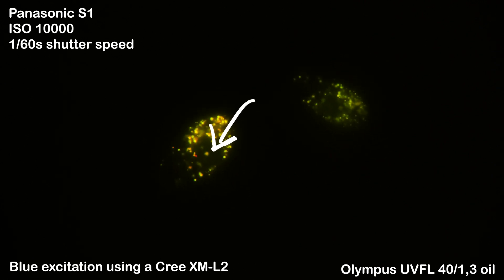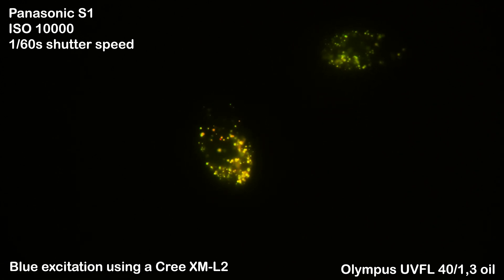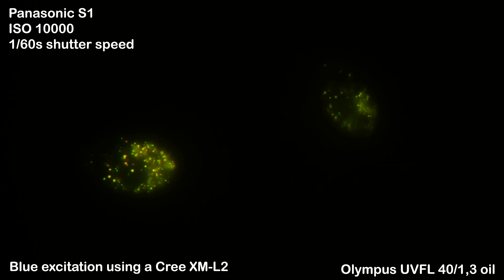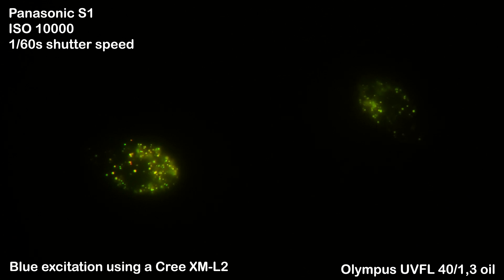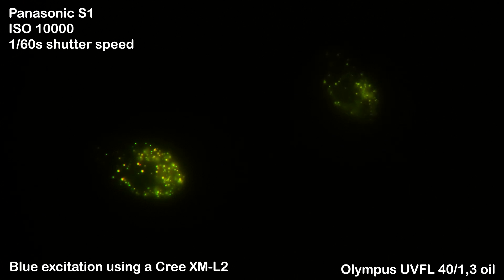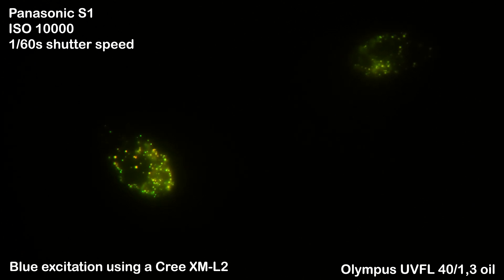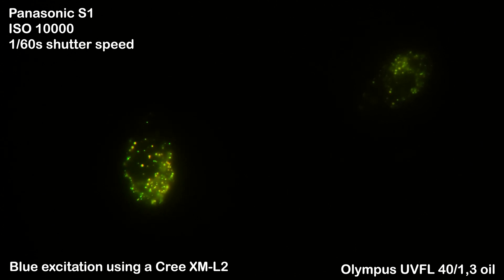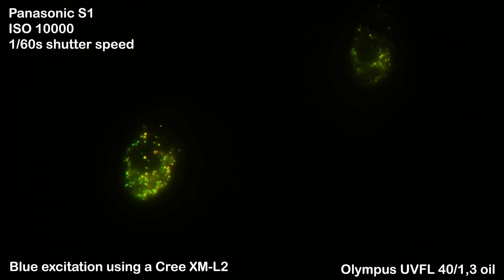In this case the macronucleus containing the DNA has not been stained but appears as a dark round shape. AO is not the most specific dye when it comes to DNA staining — it may work in one species but not in others. What has been stained are acidic compartments like lysosomes and food vacuoles inside the unicellular organism. AO tends to accumulate in these compartments and stains them depending on their internal pH: new lysosomes or food vacuoles are highly acidic, causing AO to form complexes that appear red. As these compartments age they become less acidic and turn orange and eventually green. AO is quite stable in these compartments, which allows prolonged studies of food vacuole behavior.